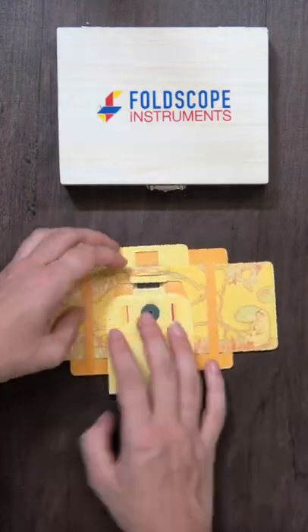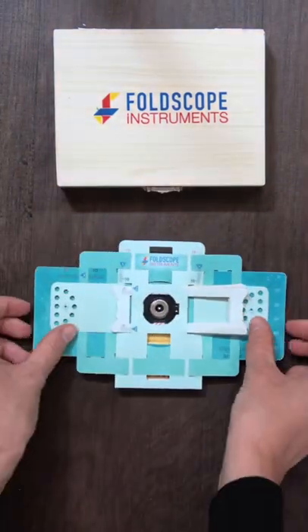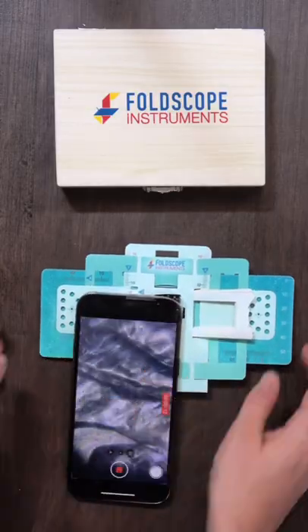Put your sample into the Foldscope, grab your LED light and your phone coupler tool. And voila! Under the Foldscope, you'll observe that this onion sample has beautiful and very distinct cell walls.